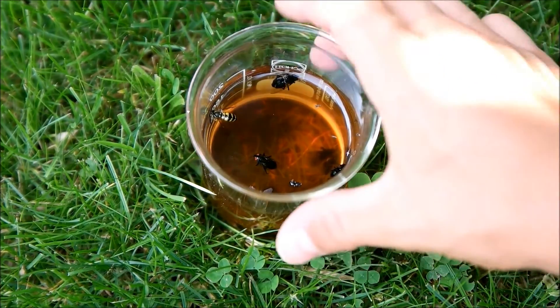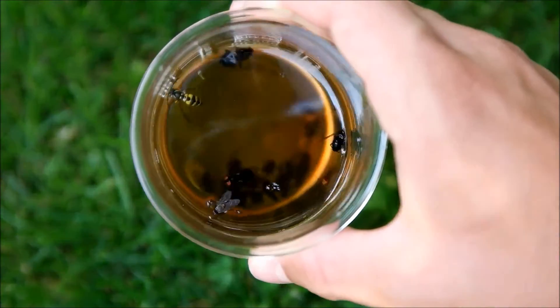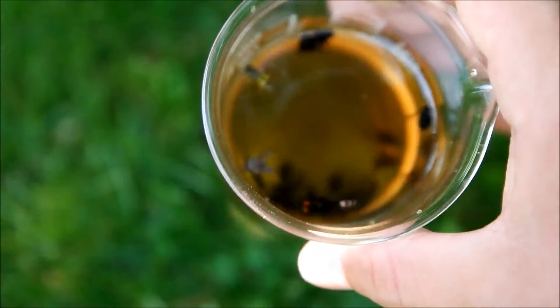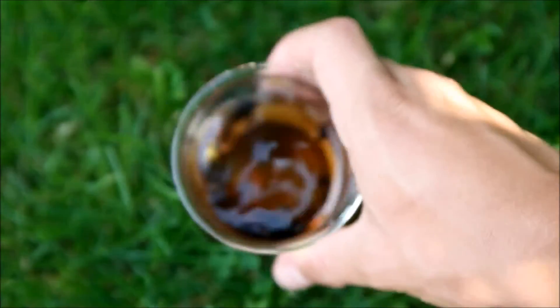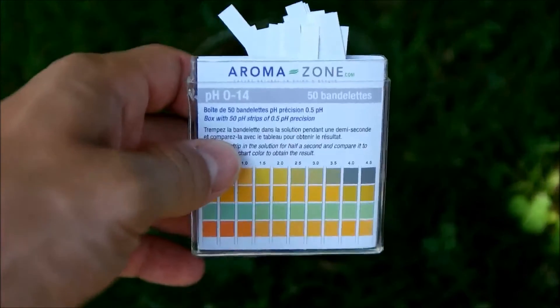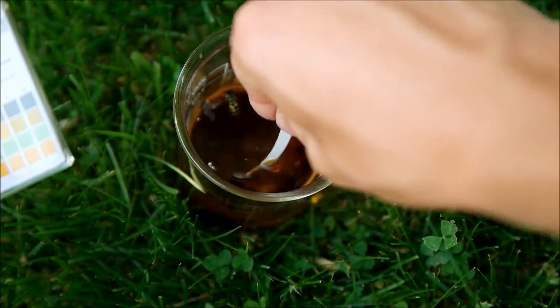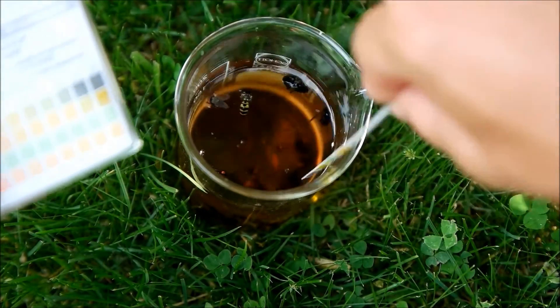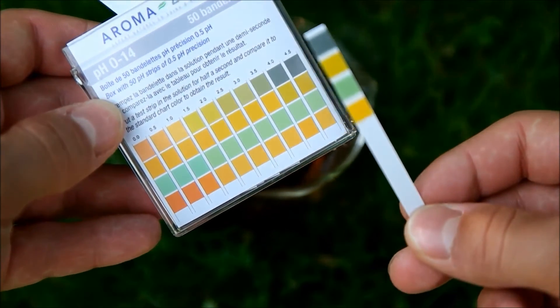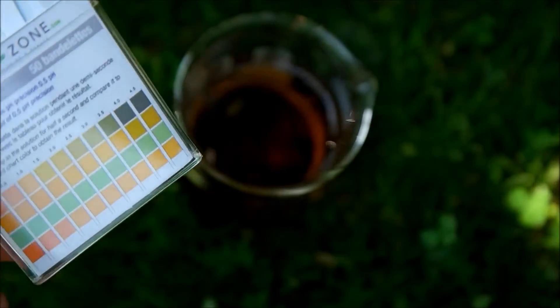Now that's a beaker with beer after three days, and yeah, it looks pretty ugly. There are a few insects inside — I think that guy is still living there. We can check the pH value with those sticks, and it says we have a pH value of about 4.5.